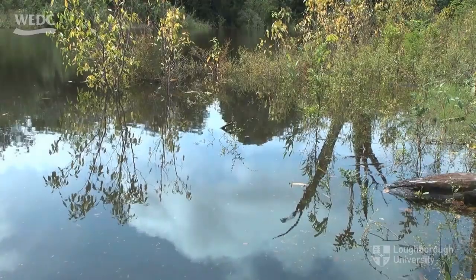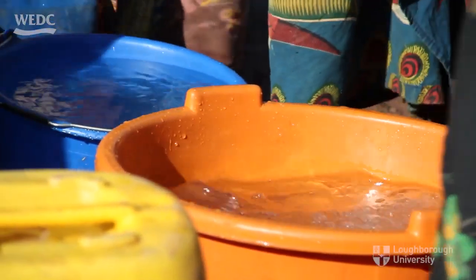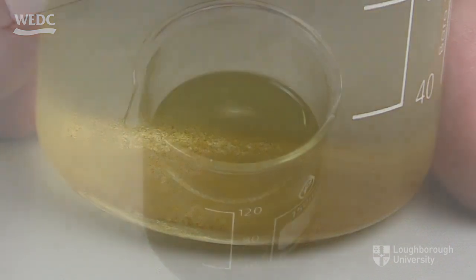Measuring the turbidity of water is an important test of its quality, as it is one of the methods of determining whether or not it is safe to drink. Pathogens harmful to human health can be suspended in turbid water.